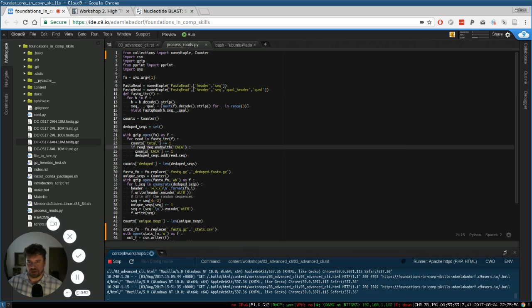Now there are 2 other things that this for loop is doing. One is I'm using a set, because remember, one thing that we want to do is deduplicate these reads and retain only the unique sequences. And then also, remember I initialized this counts object, in which I'm saying, okay, this total key is incremented for every read that we have read in.